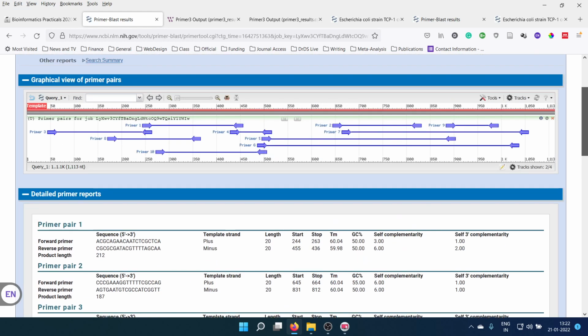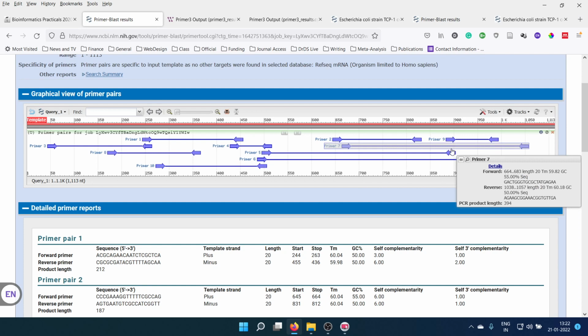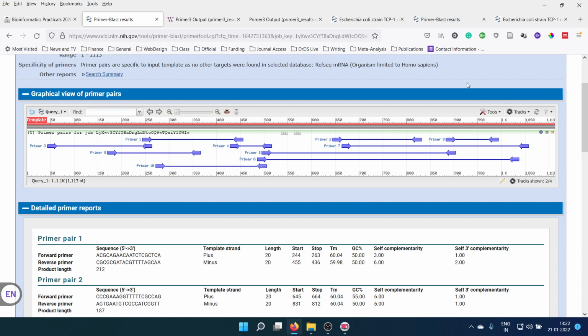You can use any of the combinations, and if your intention is just to detect the presence of the gene, any combination of the primers can be used. This is important when, say, we are designing a multiplex PCR, where multiple primer pairs will be amplified in the same mixture, and the products will be distinguished based on the difference in amplicon length.